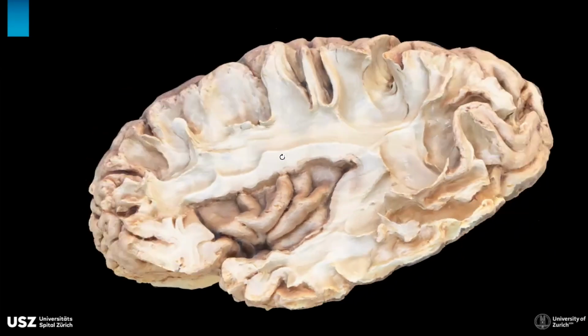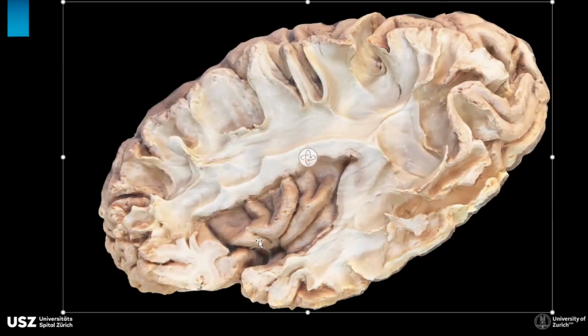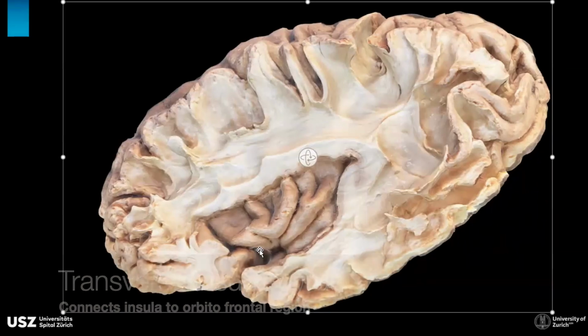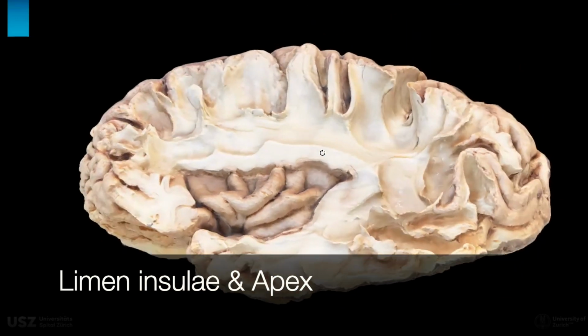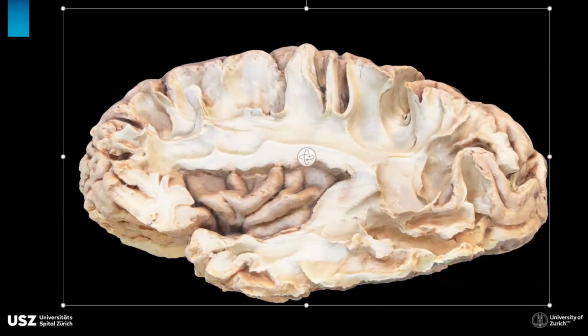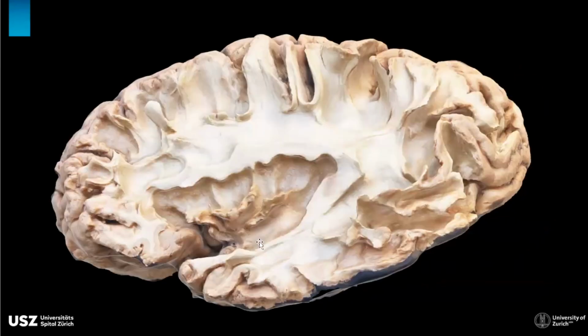You will recognize the so-called transverse insular gyrus, which connects the insula to the orbitofrontal area. And you will then recognize the limen insulae and the apex, which is the most prominent part of this pyramidal-shaped anatomical structure. After removal of the cortex, what will appear?